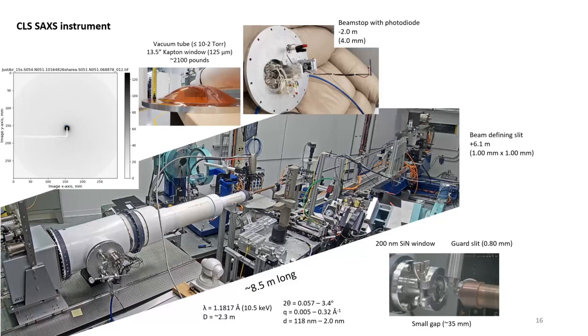Yeah, I don't know. To me, it sounds like an X-ray reflectivity thing, if you want to figure out layer thickness. I mean, can we do that? Can we do it? We've done X-ray reflectivity before, I think. So I don't think we'd use a SAXS setup to do exactly what you're thinking. We could discuss it after.